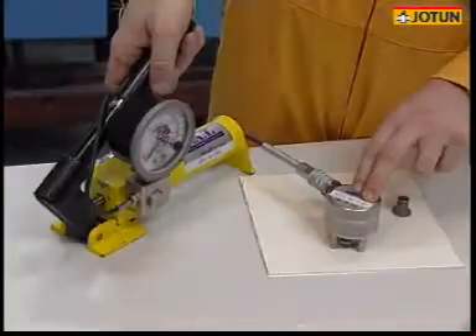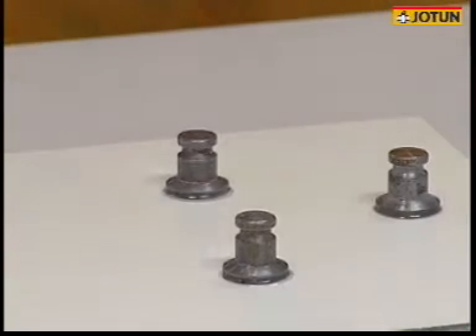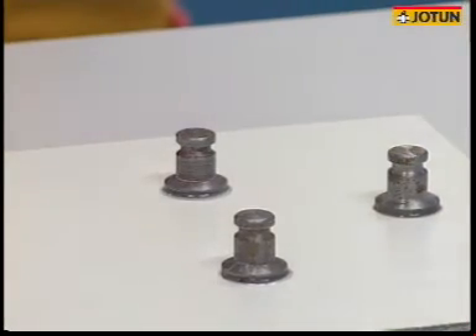Increase the pressure gently and record the pull-off value. The test should always be carried out using three dollies simultaneously.